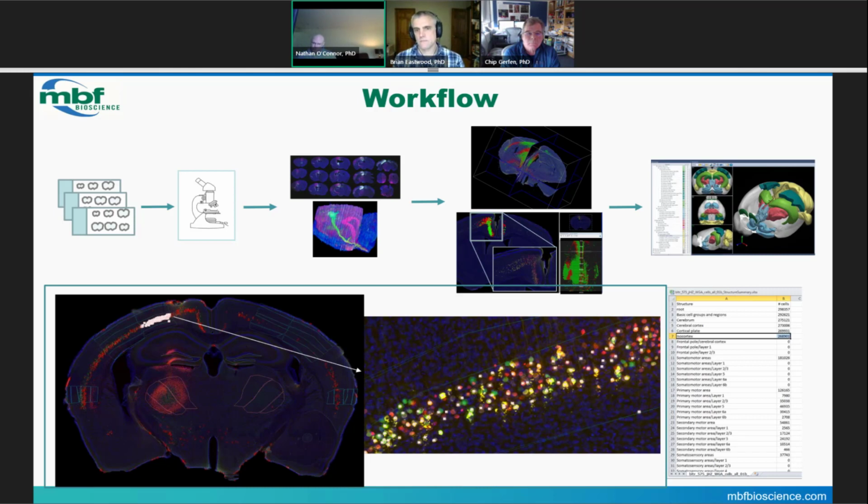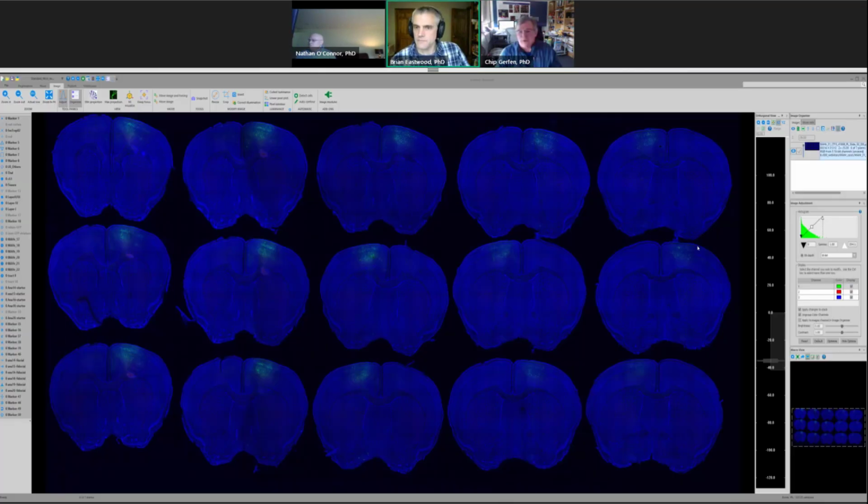And I think in total, you'll get a nice picture of our research story and just what it takes and the level of effort involved in establishing success in creating and using these neural networks. So with that, Chip, I am going to make you the presenter. Okay. So Nate, thank you very much.